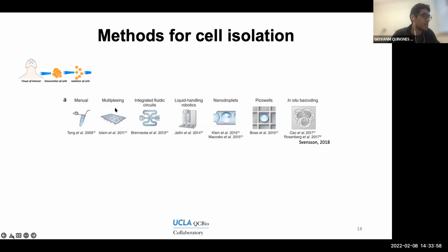Later on, we also have different techniques of multiplexing, which is a similar principle. Multiplexing itself refers to the action of merging or pooling together the signal of different cells. But it was done in a way that after a series of dilutions, you'll obtain your final concentration of individual cells. And later on, we have our microfluidic approaches, which will be the following four.